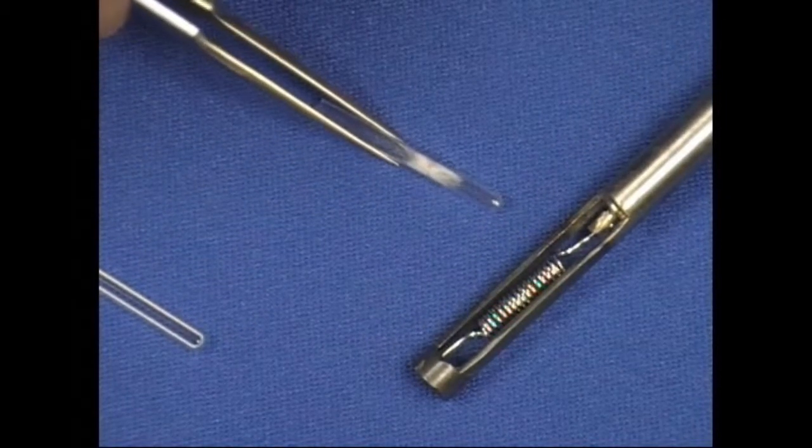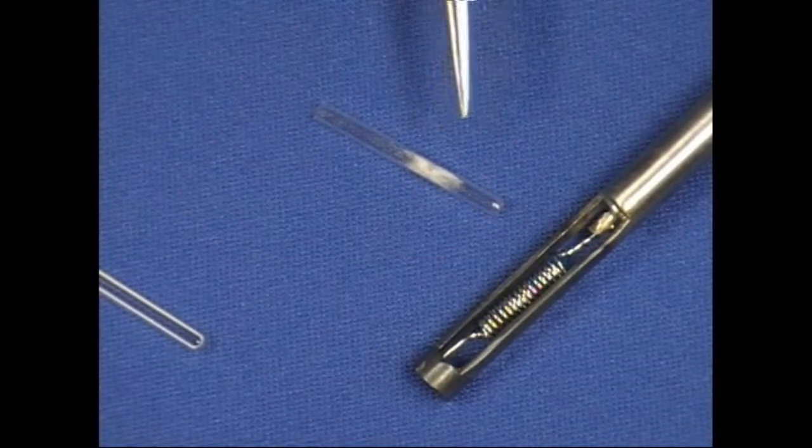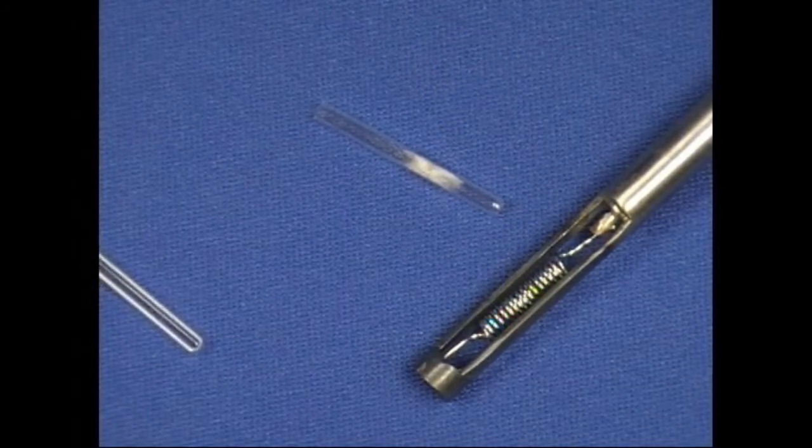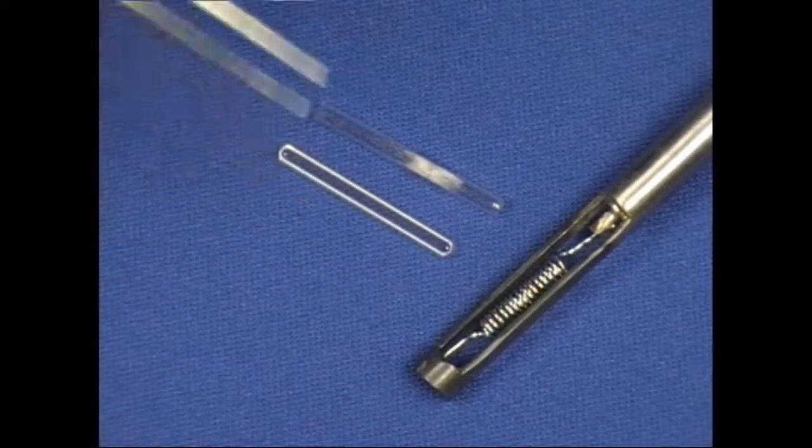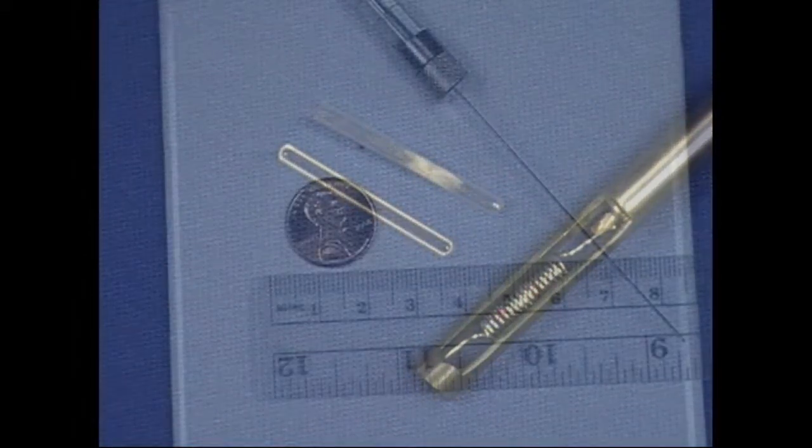The quartz tubes look like this. They generally have some quartz wool in them to hold the sample in place, and the quartz boat is like a little canoe made out of quartz, and you can put a liquid sample directly into that.